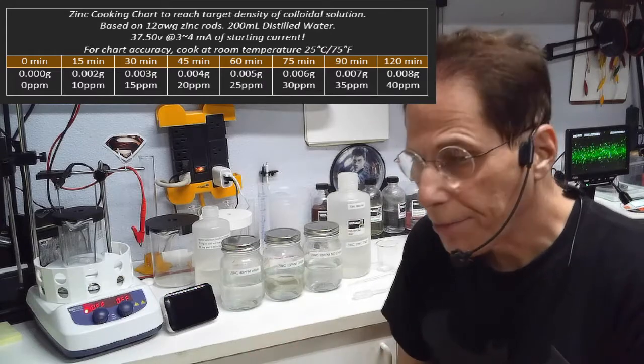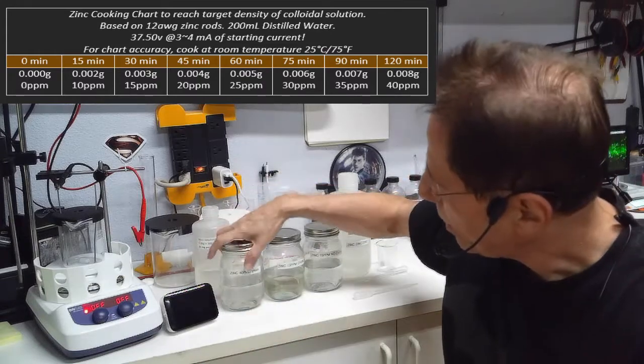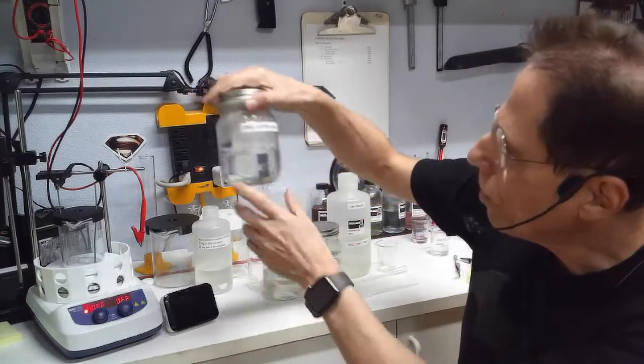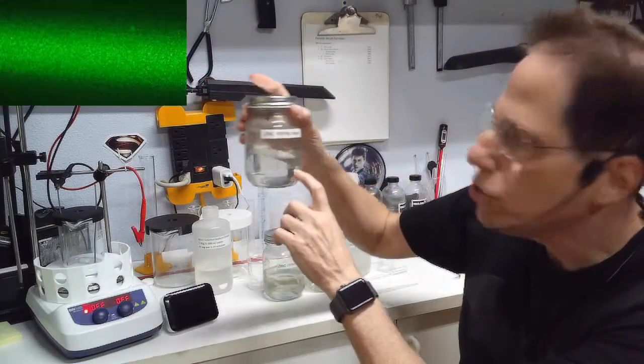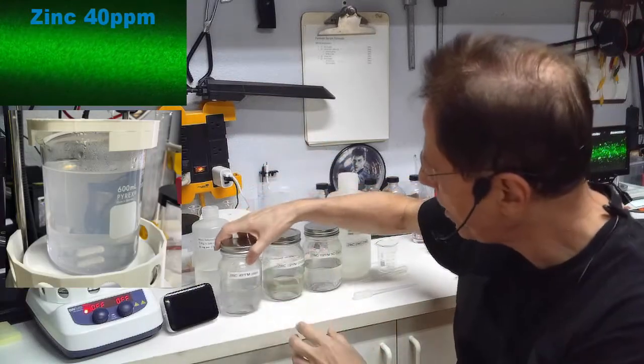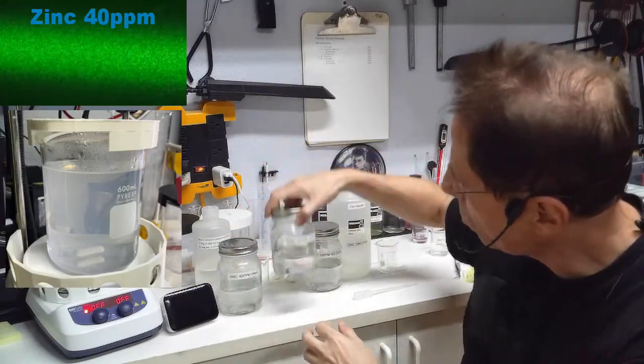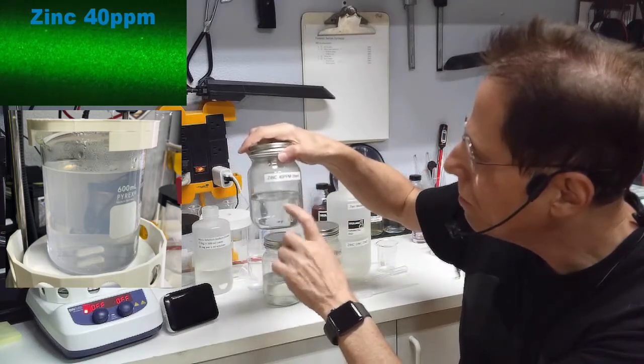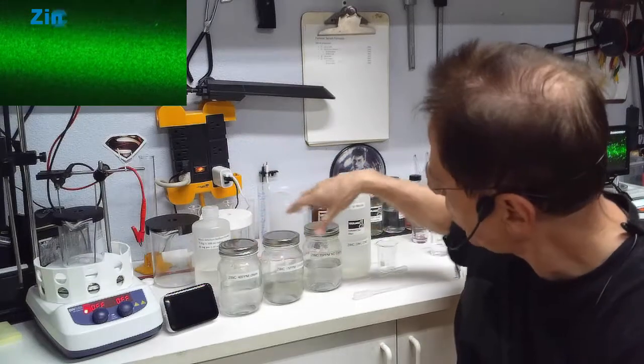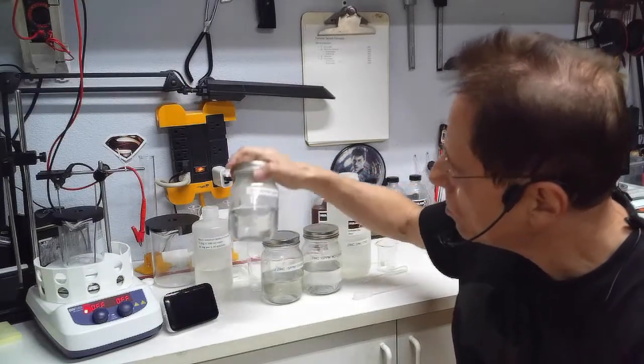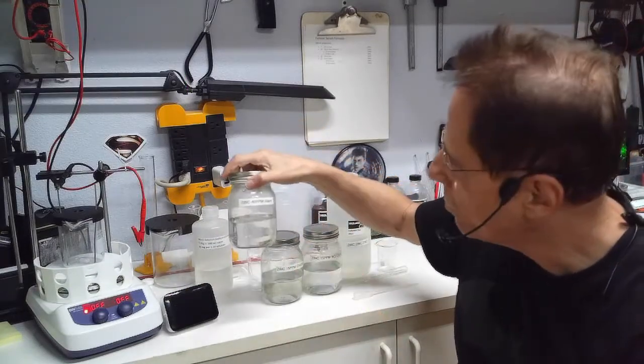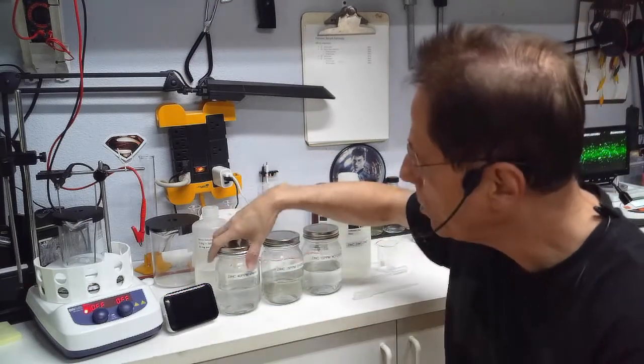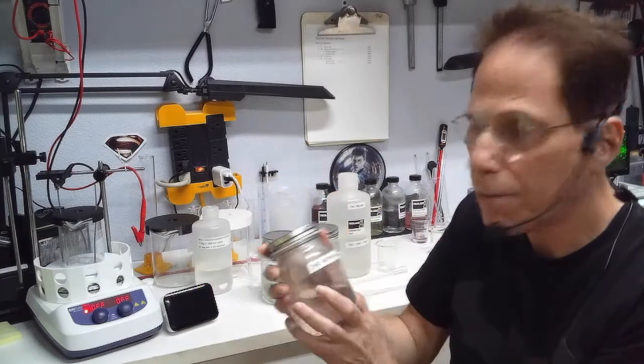So try and keep it around three milliamps, cook it for that length of time that's on the chart to get what you want. Now this is a 40 parts per million solution. The 40 parts per million solution starts to look a little milky white. This one has a very slight milky white thing to it. If you're cooking your stuff and all of a sudden it starts getting milky white, you're reaching around 40 parts per million. You don't really want to go any higher than that. I would use 40 parts per million for topical stuff.